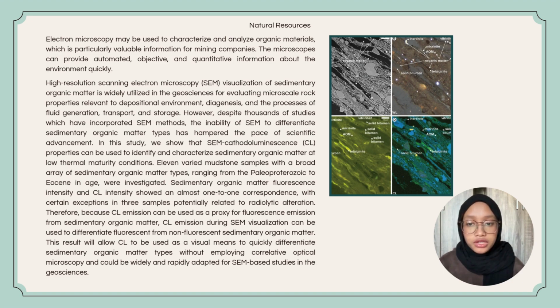This result will allow CL to be used as a visual means to quickly differentiate sedimentary organic matter types without employing correlative optical microscopy, and could be widely and rapidly adopted for SEM-based studies in geoscience.